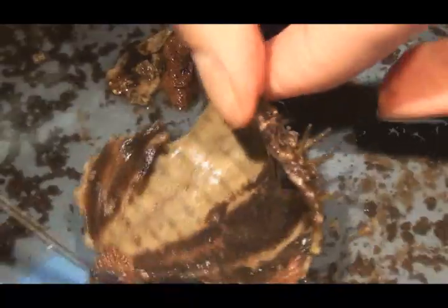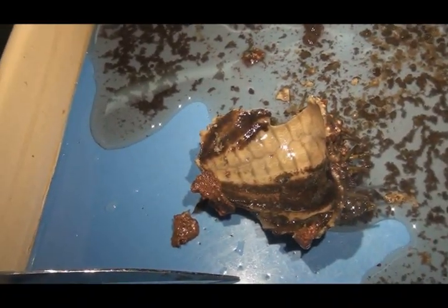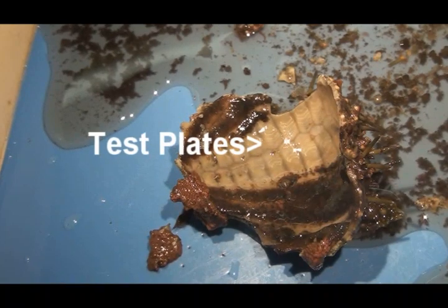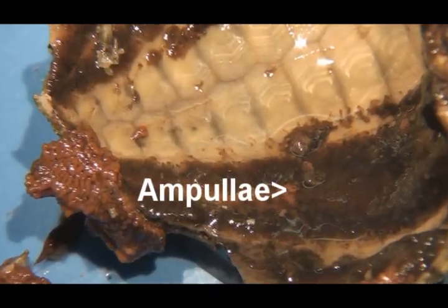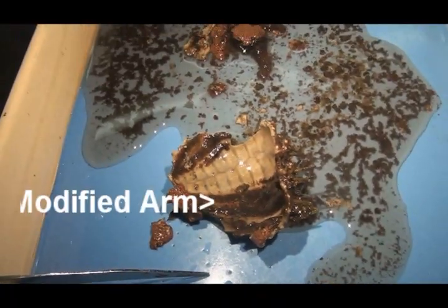Here we have a piece of the test. By looking at the inside of the test, we can see that it is made up of small plates, known as test plates. The brown gooey stuff you see right there is ampullae. That strip of ampullae is part of a modified arm.